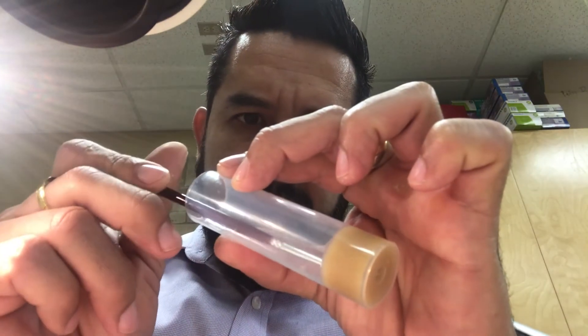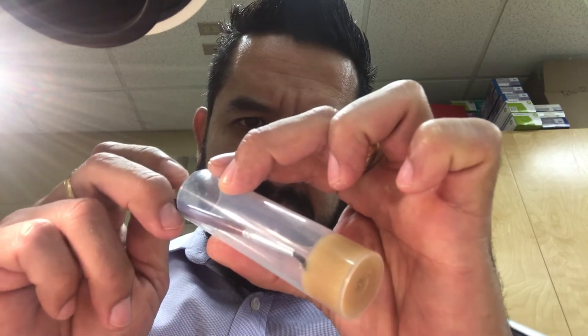The next step is transferring all of those larvae to the food vial. I'm going to start picking them up using the paintbrush. I'll take them from the petri dish — I have many here. And carefully, I transfer them to the food vial. You pick them carefully, transfer them to the food vial.